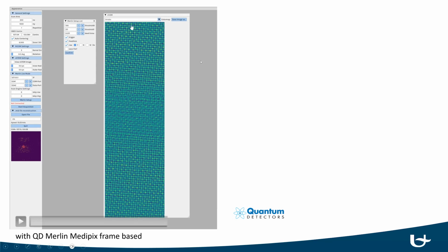But you see the image still builds up fairly slowly, and that's because this is a frame-based camera which has a maximum frame rate per second, which is still somewhat limited. So that forces me to take dwell times which are still tens or 100 microseconds. I don't exactly remember what we used here. It's probably written here somewhere. I don't see it, but let's say order of magnitude 100 microseconds.